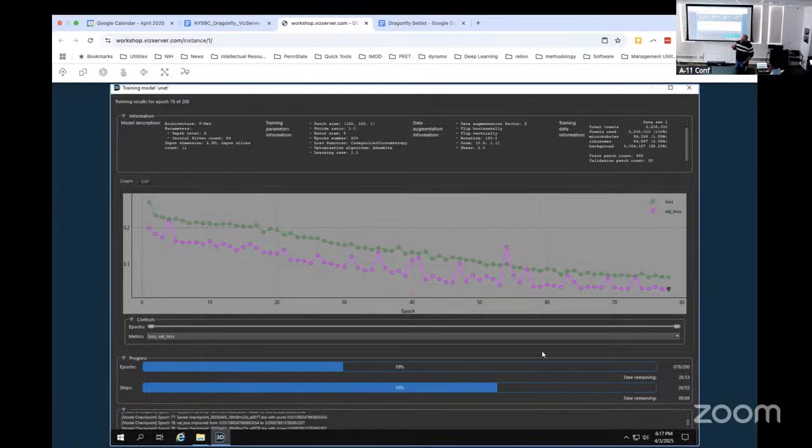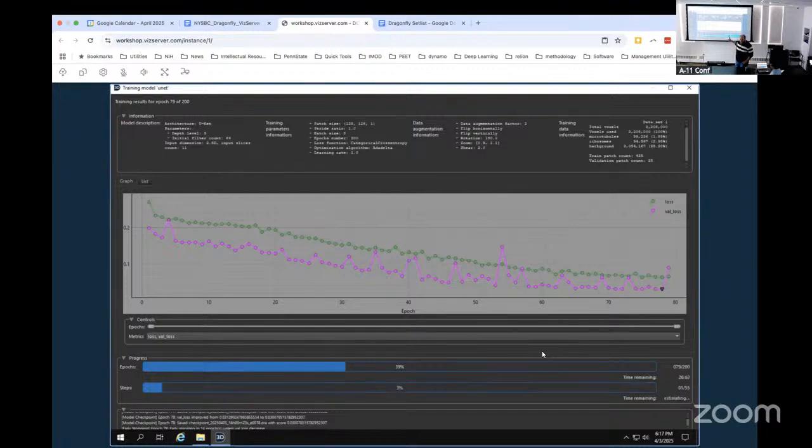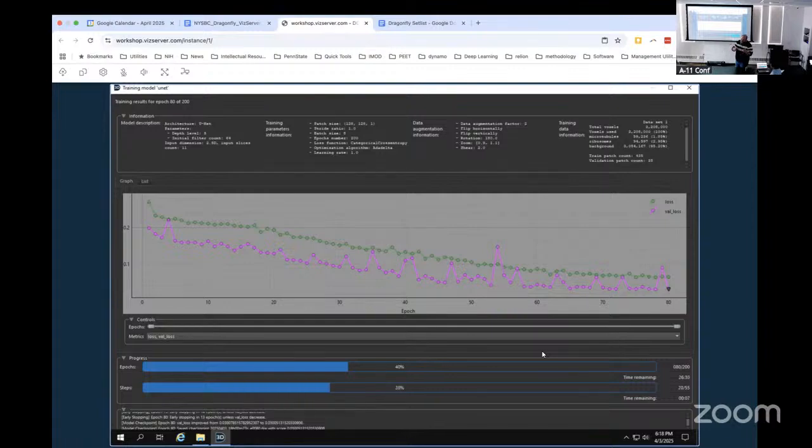I wouldn't spend too much time hand annotating. I would hand annotate a small piece, similar to what we did, 400 by 400 maybe. Run and infer the network, very easy. See how well it does, and then you can take this initial output and correct it, and feed it back, and sort of do an iterative loop.